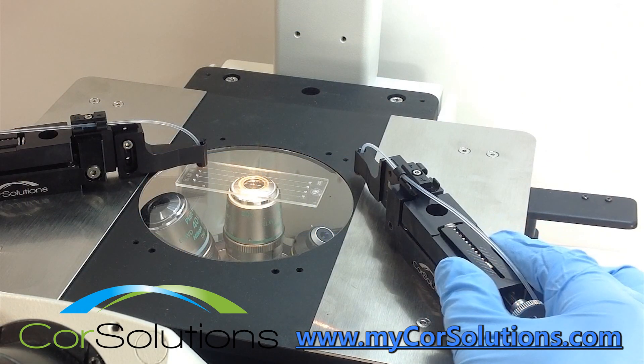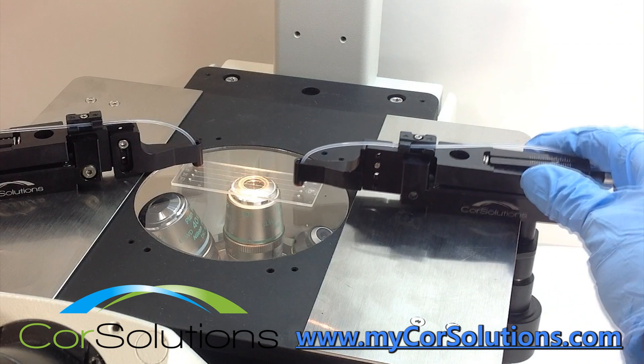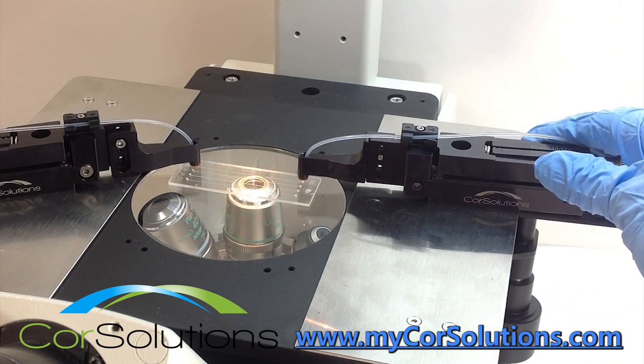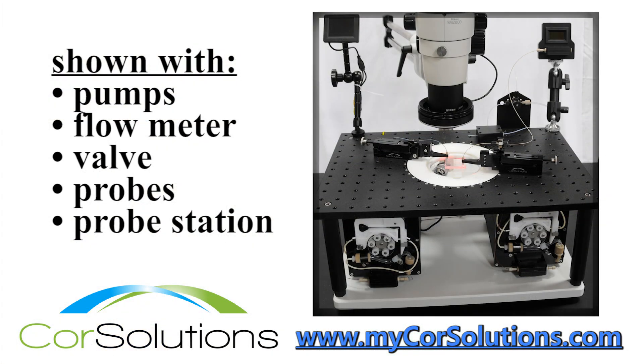To use the Core Solutions Microfluidic Probe, simply move it over the desired location and release the compression mechanism. To break the connection, just push down on the mechanism and slide the probe away from the port. It is fast and easy to make quality connections, remove connections, and change fluid type. The probes work for liquids, gases, or a mixture of both.